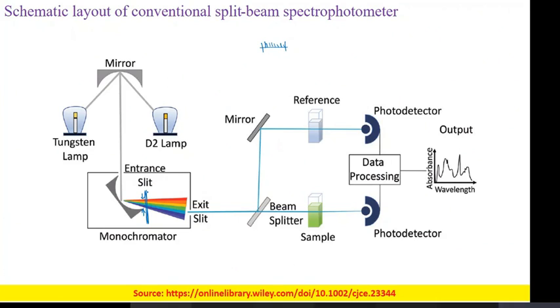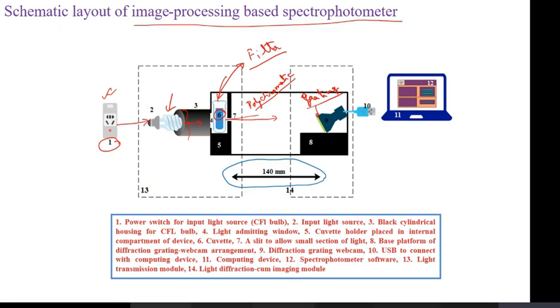Now, if you take this detector slightly towards the right, what will happen? The same spectrum will be incident on a larger area. So the resolution of your wavelength detection will increase. Okay, similarly, so what is the grating we have put over here, and we are getting good results.